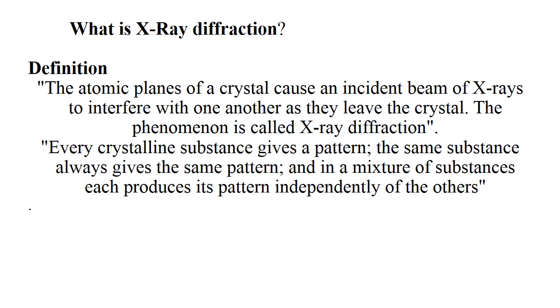The same substance always gives the same pattern, and in a mixture of substances, each produces its pattern independently of the others, as we have discussed earlier. Every substance has a fixed structure, and if we obtain the X-ray diffraction pattern, it will always be the same, either pure or in mixture form.